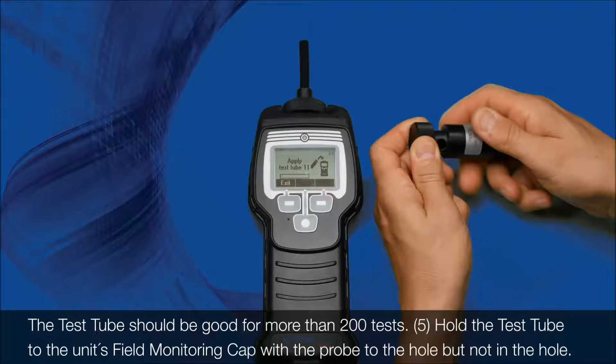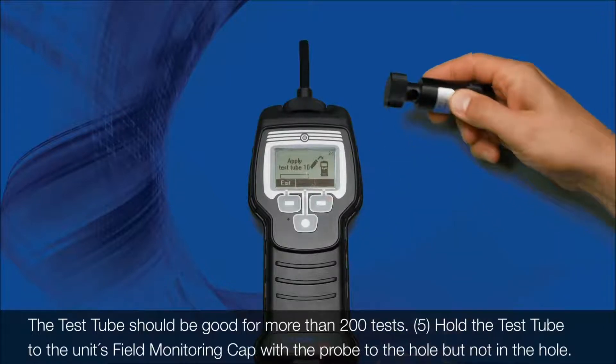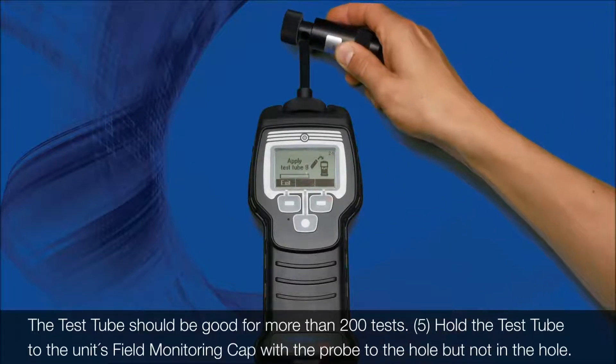The test tube should be good for more than 200 tests. 5. Hold the test tube to the unit's field monitoring cap with the probe to the hole, but not in the hole.